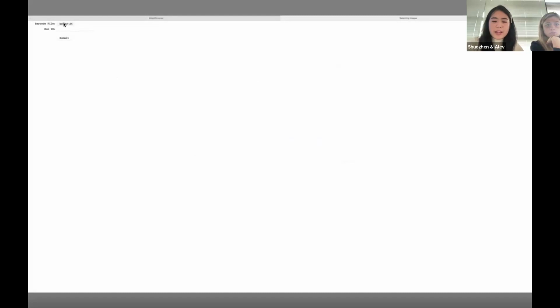If you go into the Atlas browser software package, in their folder, there are actually several versions of barcode file that you can select from. You can also customize it. So here you can leave the run ID empty, but I will just put it here, like this is the GBM sample. So you can make your run ID here to identify it from your different practice. Once you submit it, it will read the data.